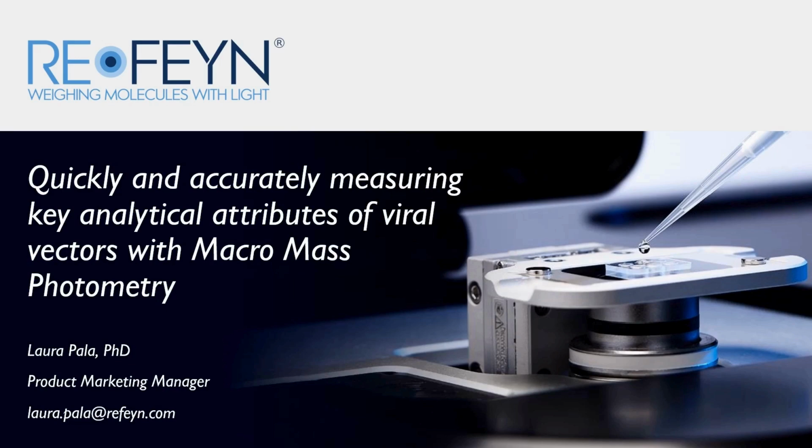I'm really excited today to be here to tell you more about macromass photometry and how it can be used to assess key analytical attributes of viral vectors.